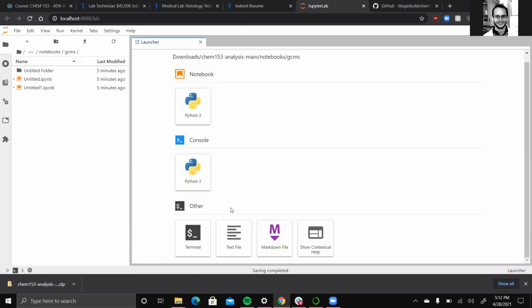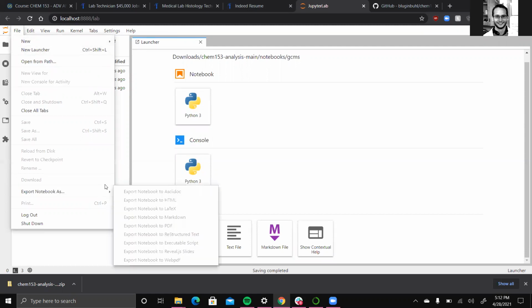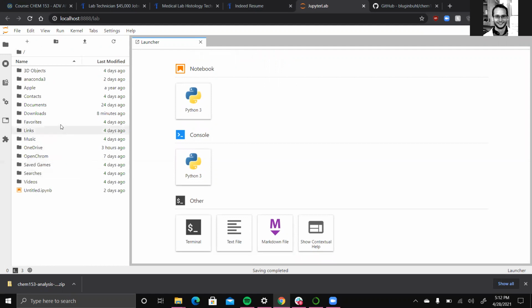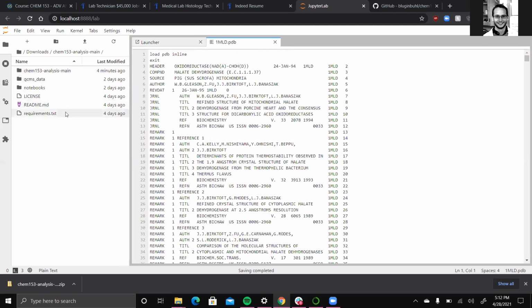So real quick, can you click on the top left of the file browser over there? There's that folder icon. Not that. Close this drop down. Click on, actually, let's see. So it's top left, like, there's a slash and then /notebooks. So the file object next to that, click on the home. So it's probably in your downloads folder where you extracted the file, right? So there's that. Okay, now go to notebooks, sorry, I misspoke.